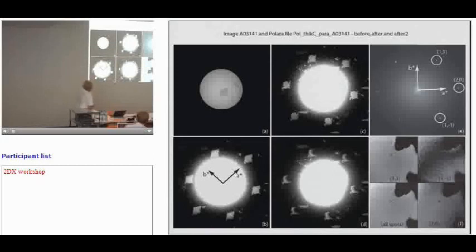So we've burnt away about a third of the diffraction power. So the diffraction spots have faded to about 2/3 of their intensity. But it's still perfectly well oriented, so it ought to be perfect everywhere. And because we had it on thin carbon, and then we burnt it all away to show where the beam really was, you can see it's burnt this circular hole. And these are the pseudo dark fields where you cut out one spot, back transform, and find where did the power for that spot come from.